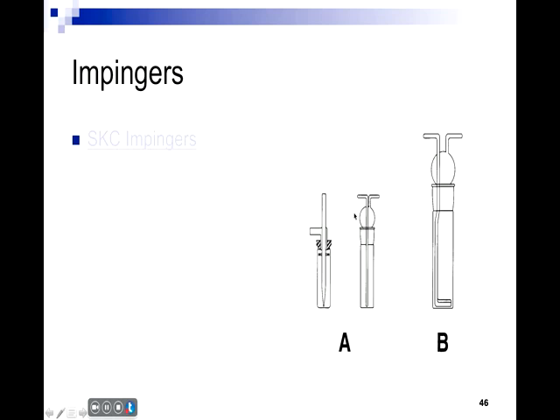You can also use it for aerosols, because dirty air is going to stay behind in the aerosols, and this technology has been in use before the Gauley Bridge disaster. There were impingers that were available to bubble dirty air that contained dust into these impingers, and once you're finished with your collection, then you can take aliquots of the air and put it on a microscope and count the particles. In the old days of industrial hygiene, they used to do just that. They would collect dirty air through water, take aliquots of the water, put it on a microscope on a grid, and count how many particulates there were present based upon the volume of air that went through. And you would see expressions of particulates per so many cubic feet of air.